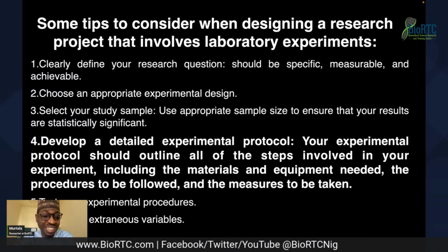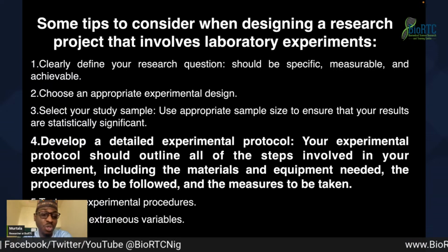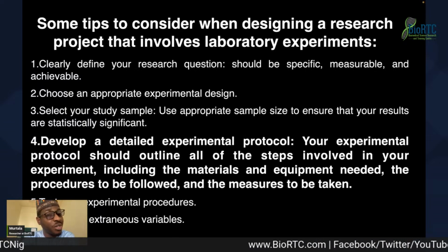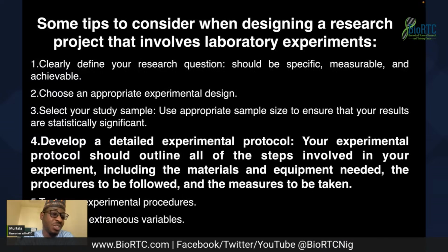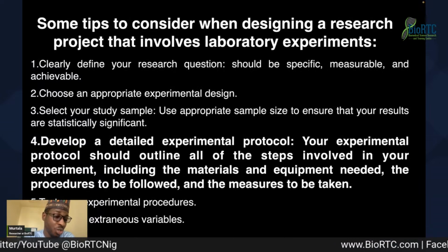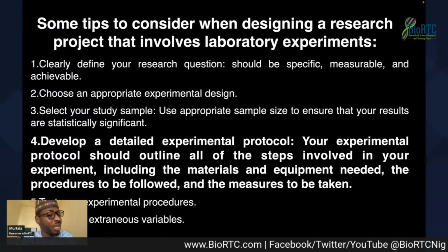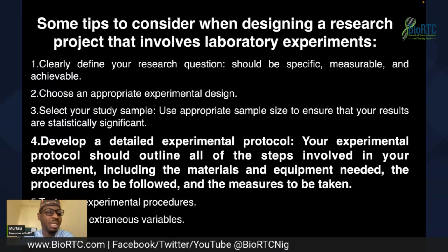Sometimes the procedure, one of the buffers is not working. Sometimes some of the chemicals are not working. Sometimes you need to optimize. So these are some of the things that during your design you need to be aware of: not every time you do an experiment are you going to get it the first time. So sometimes you need to really test your experimental procedures.